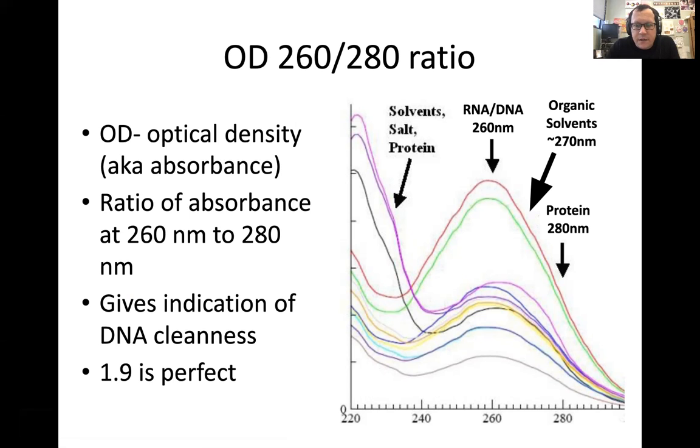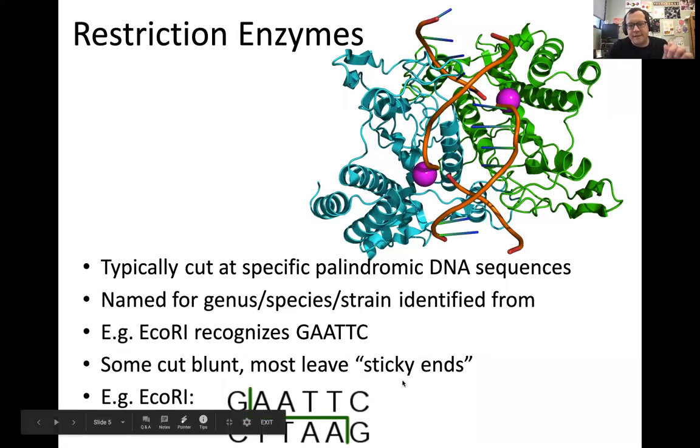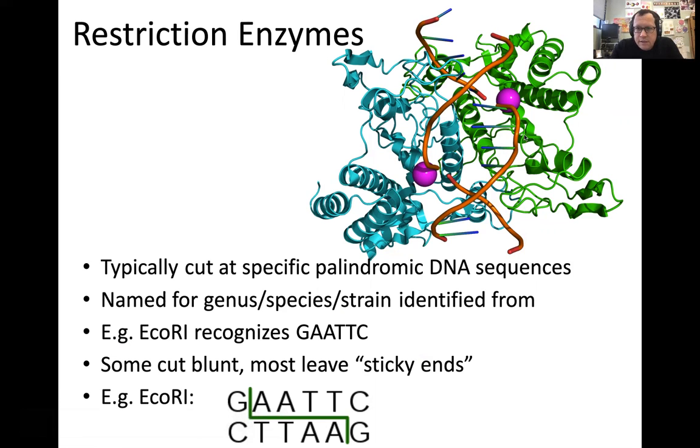And so this week, what we're going to do is use something called restriction enzymes to cut our DNA so that we can see exactly the DNA that we have. Okay, so restriction enzymes are these enzymes. Enzymes are proteins, and they cut DNA. This is a chemical structure, or a three-dimensional structure, of a restriction enzyme binding onto DNA. So this twist in the middle, that's our DNA helix, and these squiggles, we'll talk more about what these mean later on in the semester, but these things represent proteins. And so they're binding onto the DNA.